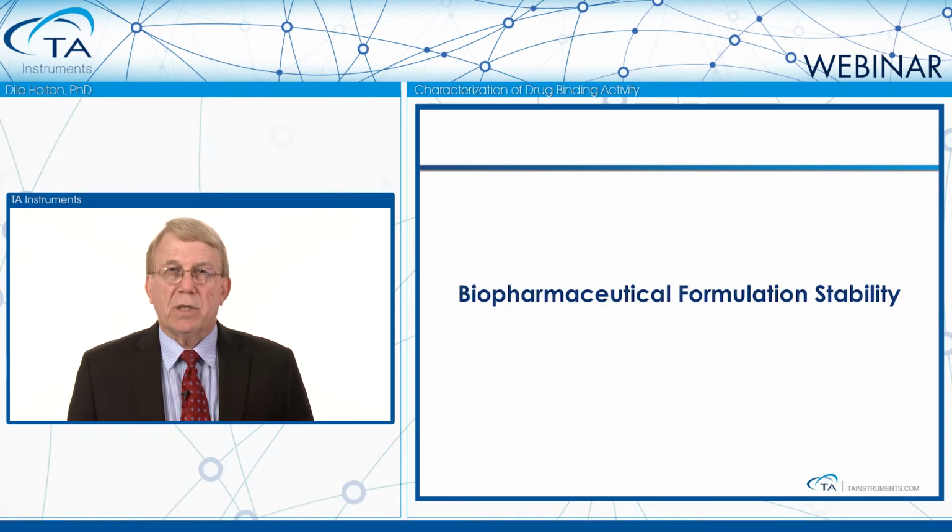So I hope that's given you a sense of the excitement that we have around enthalpy screening using ITC at a very early stage of selecting candidates, whether biopharmaceuticals or drug candidates, and the idea that the instrumentation is there to help you do it.